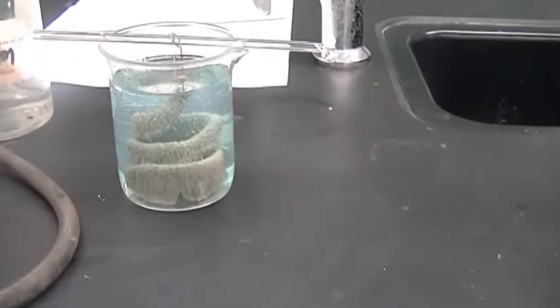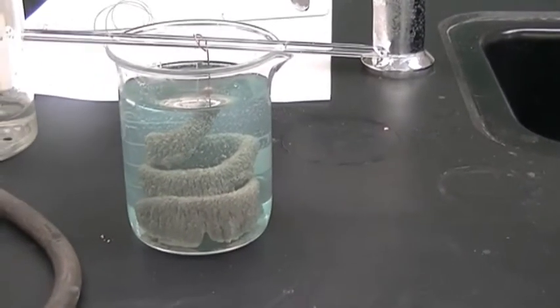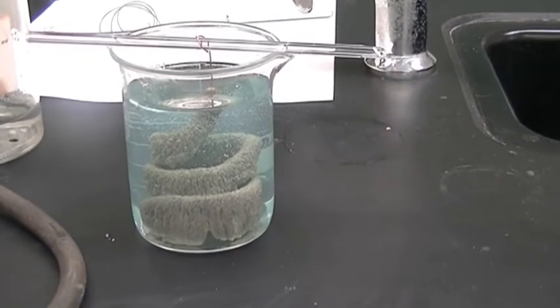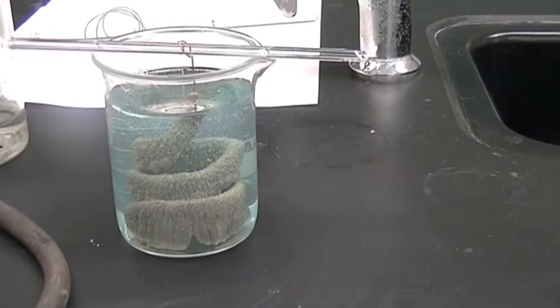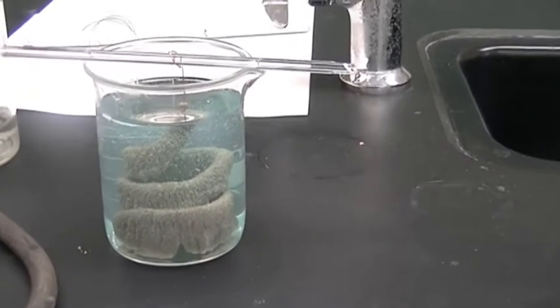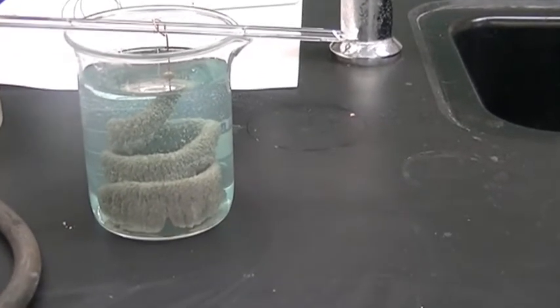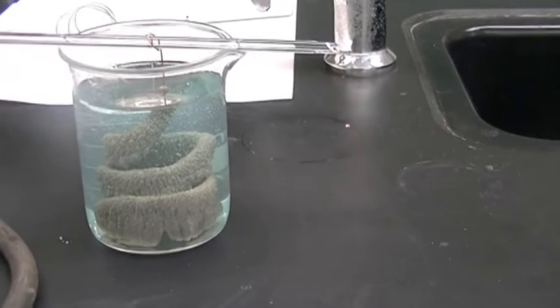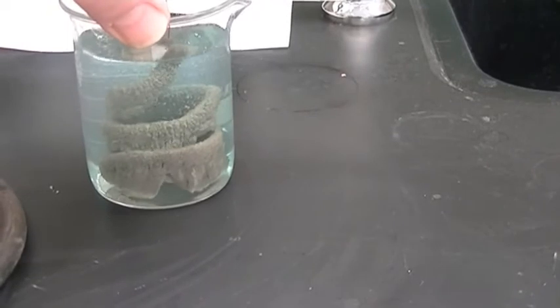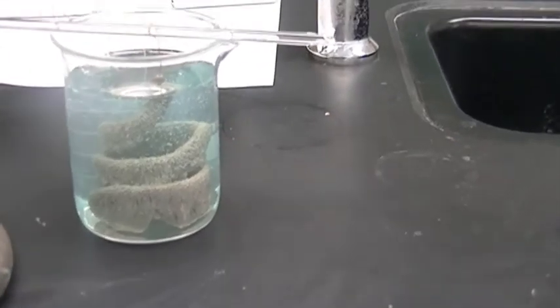Alright, and so this is the silver that is precipitating on the copper metal. This is a single replacement reaction, where the silver is now collecting on the copper and the copper is going into solution. The copper going into solution is making this solution get to be more of a bluish color. Again, I will move it around a little bit. So that is the silver that is growing on that copper metal.